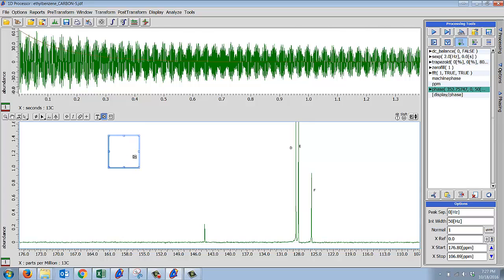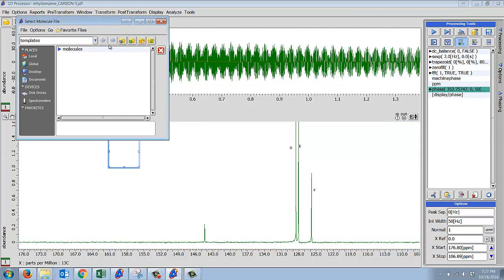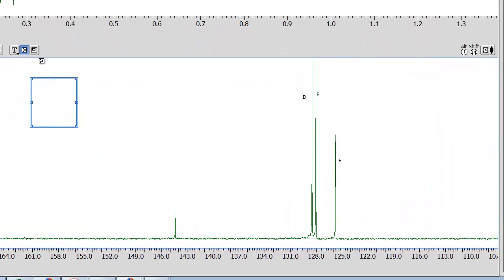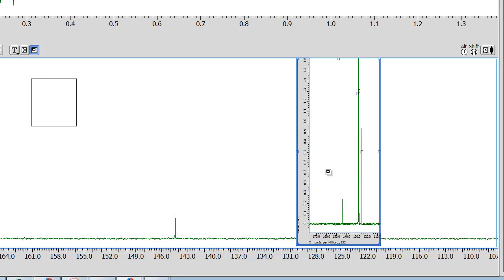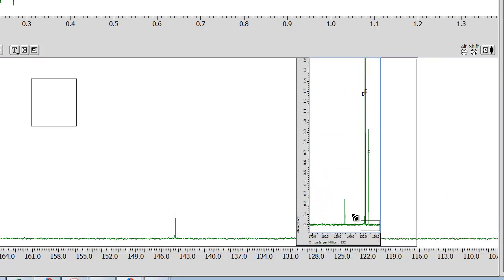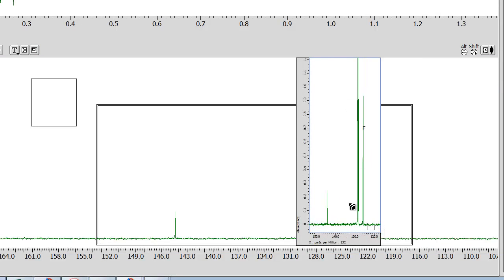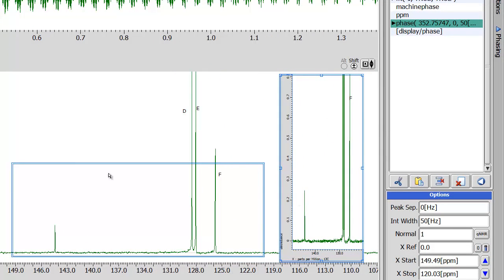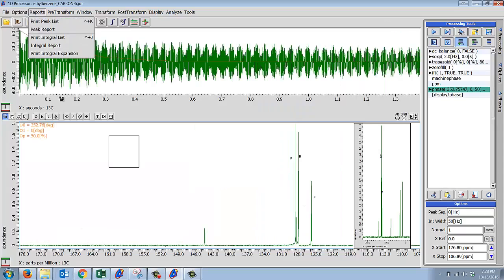You can actually draw structures in your sample, and in the other one you can do the same thing, and you can paste it on here. We don't often use that, but it is an availability. And the next one is your picture-in-picture. So if I wanted to click on this to see my picture-in-picture, I can zoom in on the peaks in here, and then I can move these away wherever we want it. Additionally, there are some other options in here.